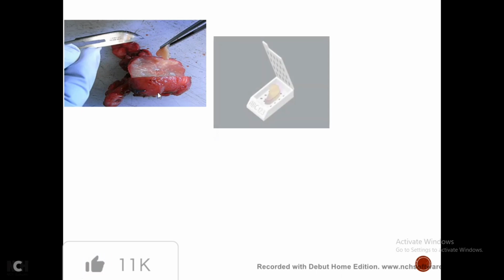This is the picture of a surgically removed tumor. Currently, ultrasound and CT scan may show whether it is benign or not, but pathologists don't know much when they receive the sample in the laboratory for histopathology. So the first thing that histopathologists do is observe, and then take measurements in all dimensions, and then the pathologist needs to cut it into different thin sections to be submitted into the cassettes.